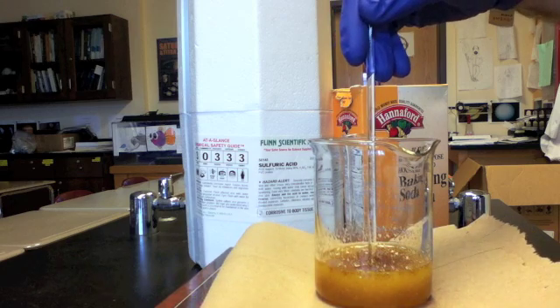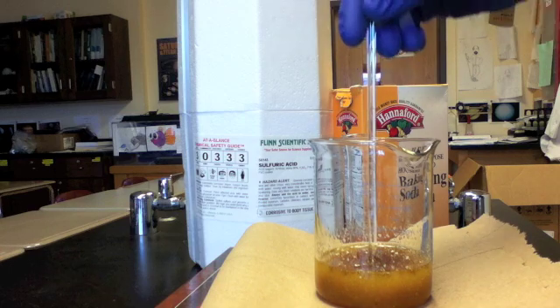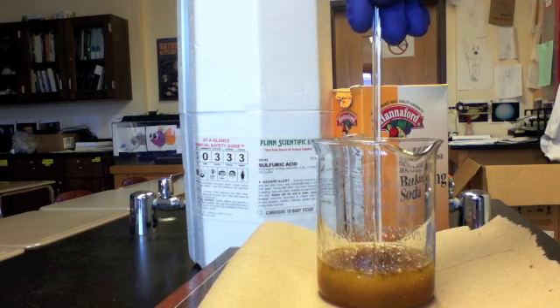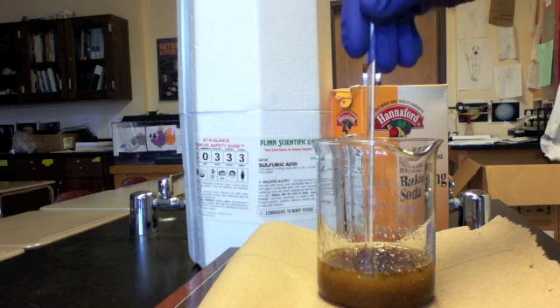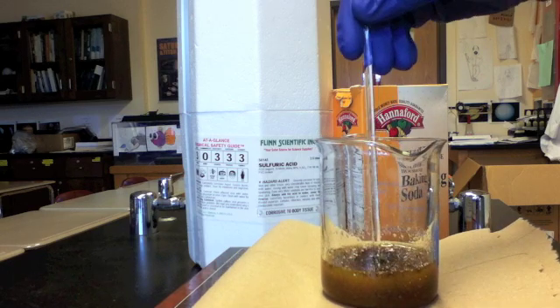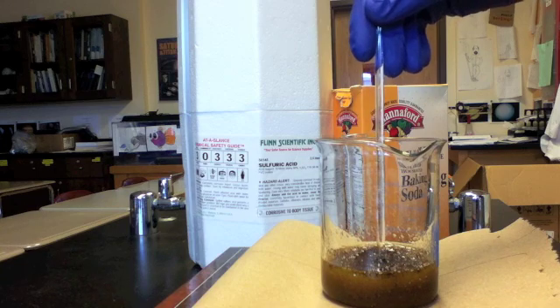When the sulfuric acid is first added, it causes a series of color changes from the original white of the sugar to yellow to brown to black. Things don't really get going, though, until we add some water, which I will do in a moment.